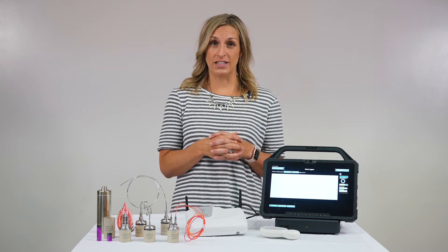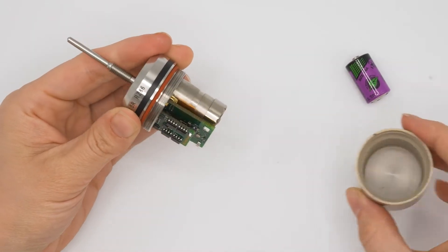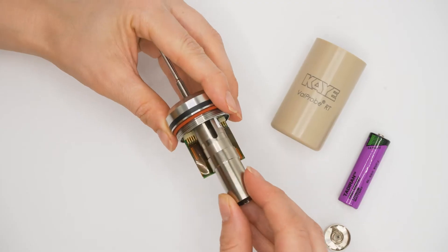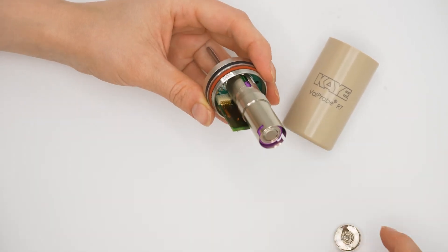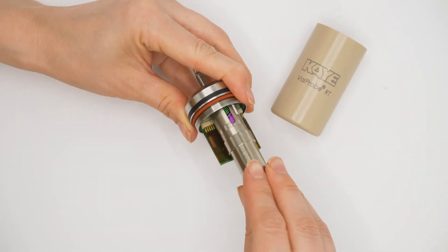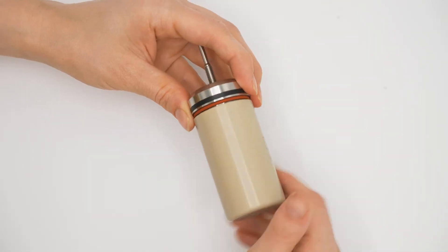Some features we've added to our real-time system include improved battery life. In the RT system, you can actually put your battery to sleep so it's not pulsing in the logger when not in use. We also have a canister for ultra-low temperatures — you remove the small canister, add an almost double-A size battery, and replace it with the extended canister, giving you double the battery life in ultra-low temperature.